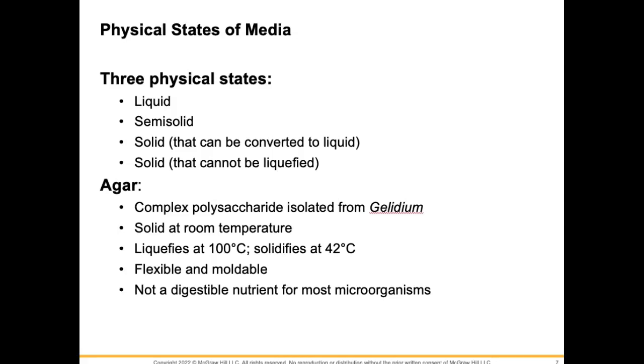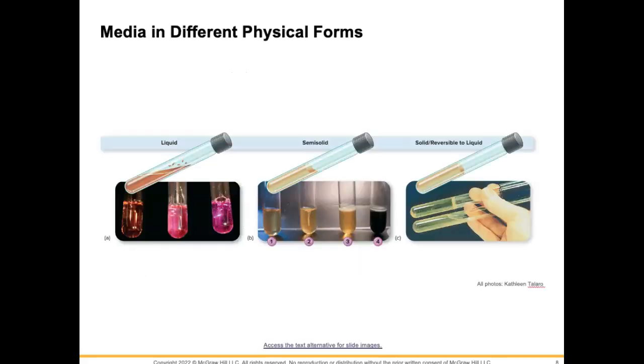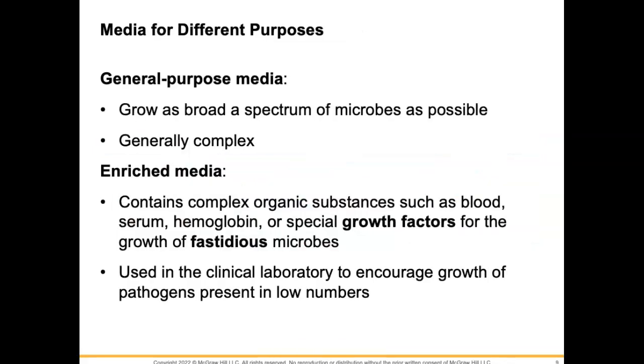And agar is not digestible by microorganisms, most of the time anyway. So that means it's going to withstand the incubation and the microbes growing on it. So that's just an image of what we just talked about.